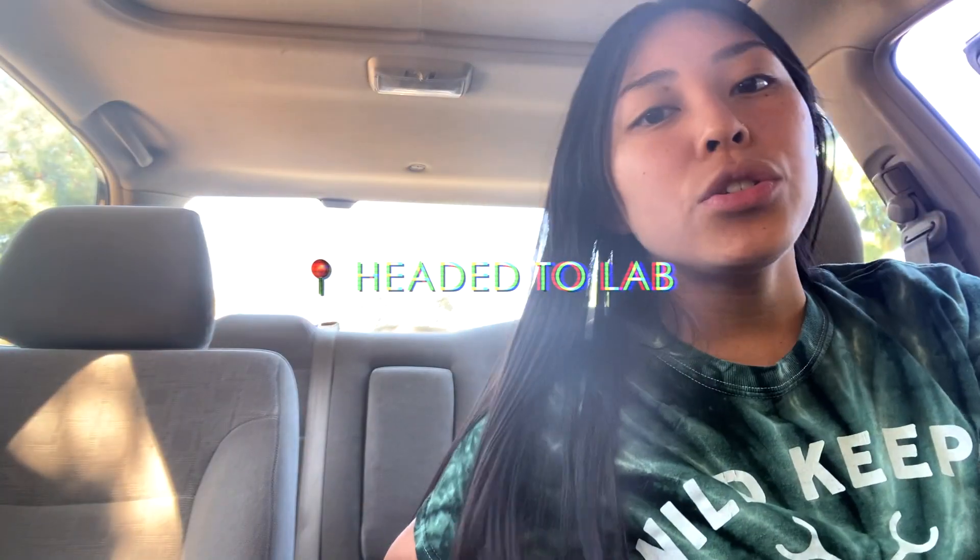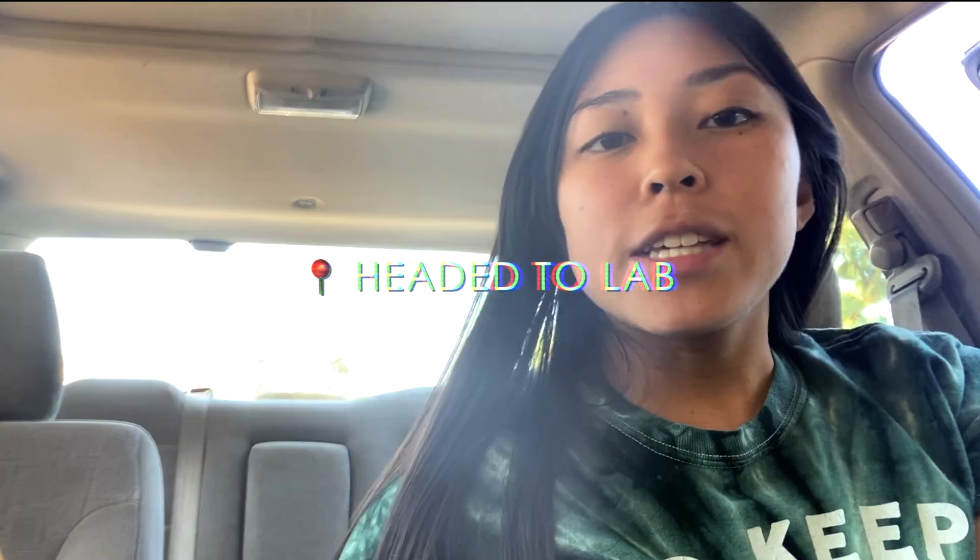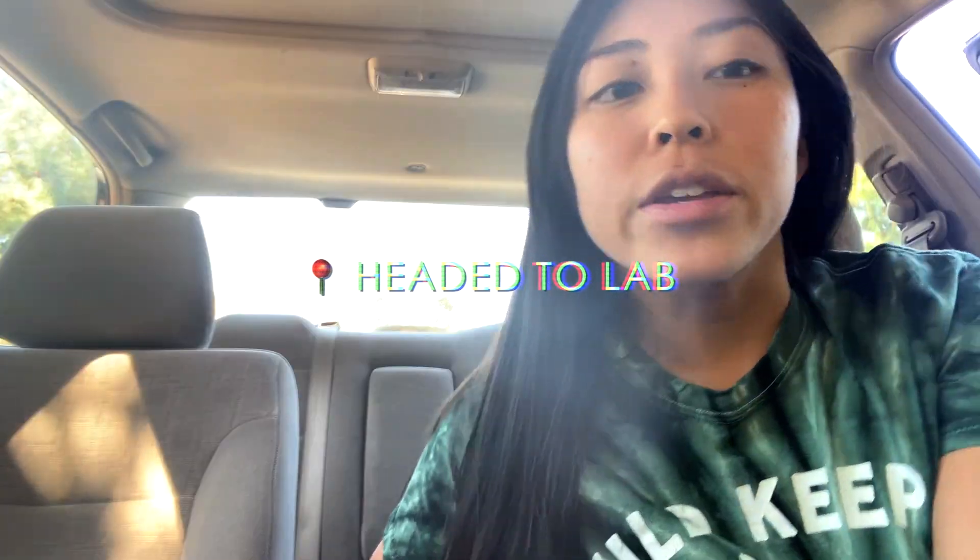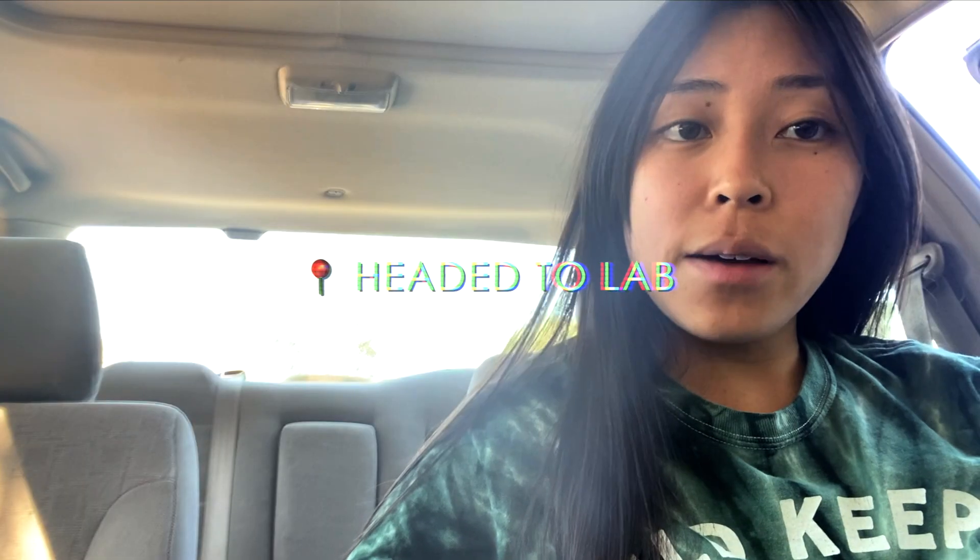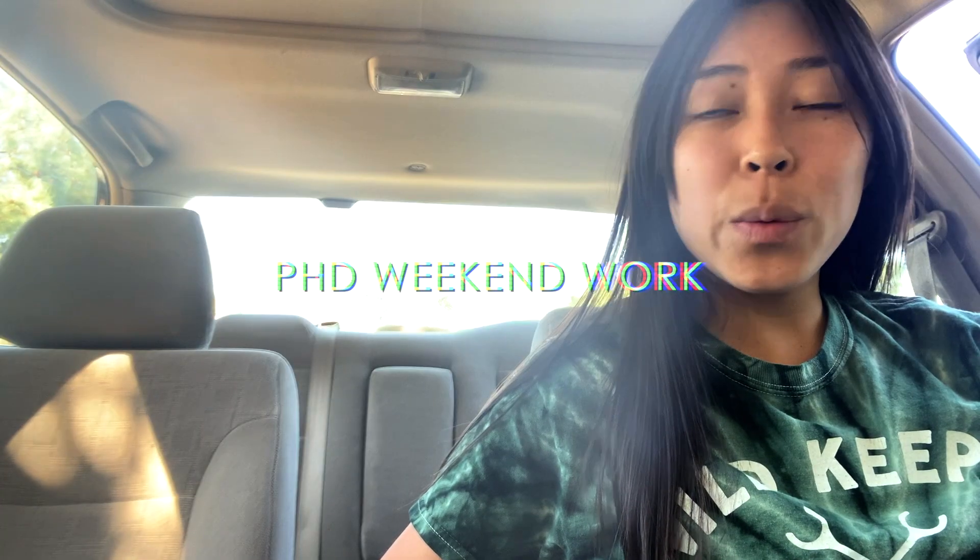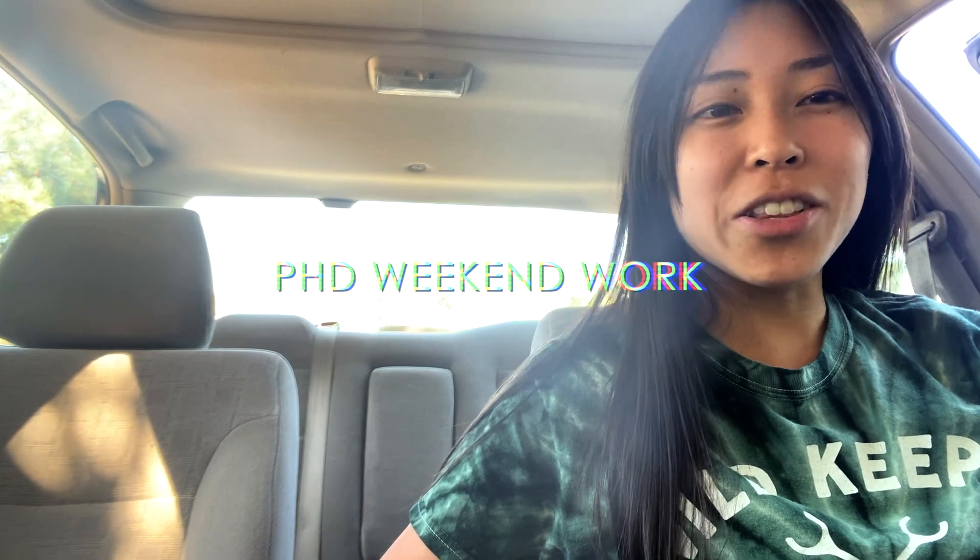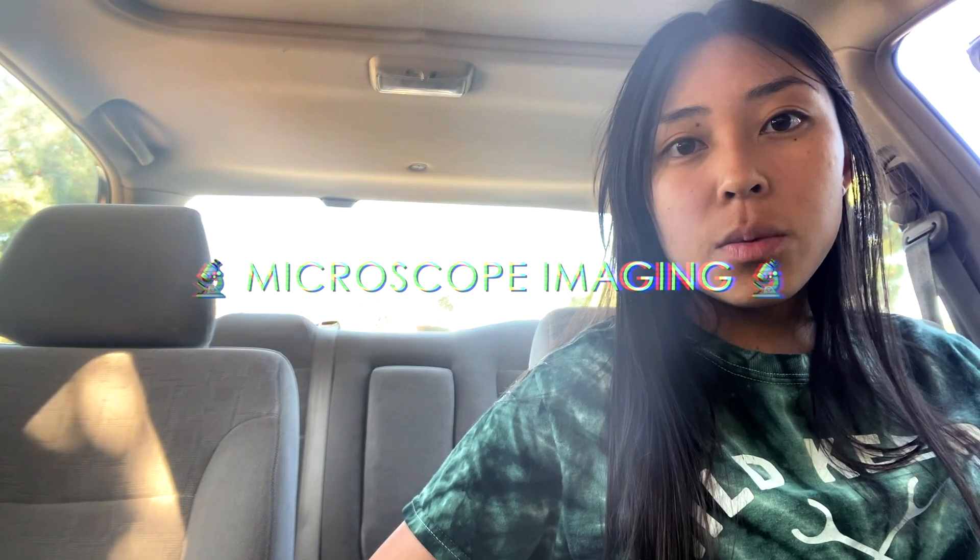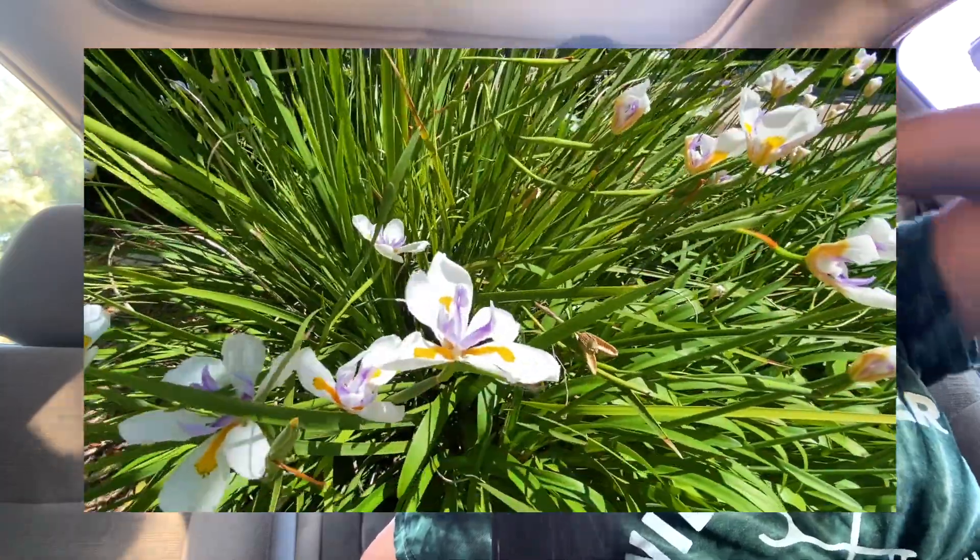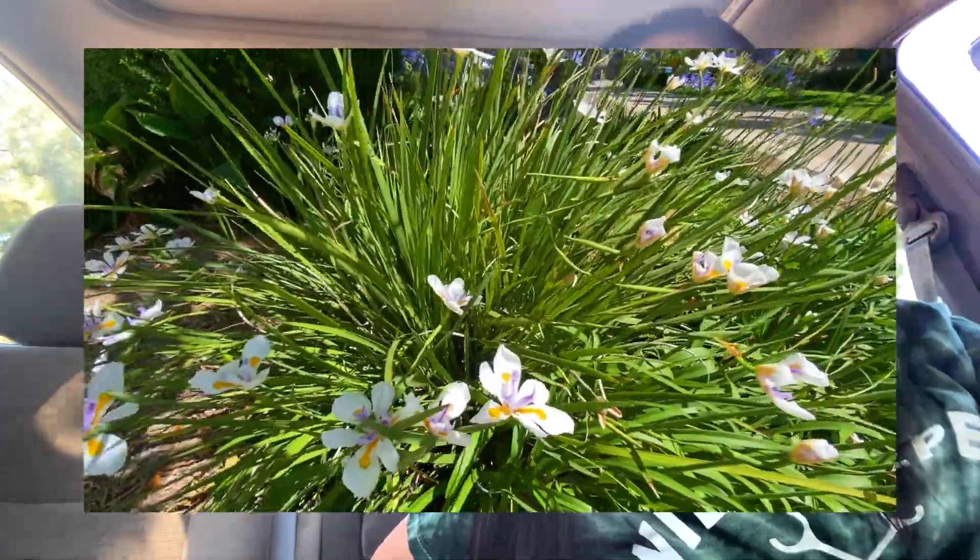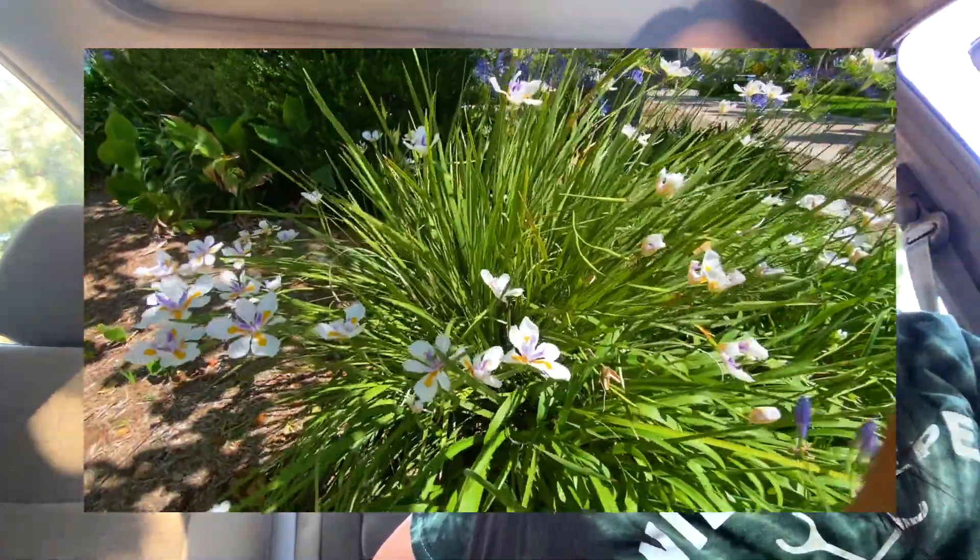I wanted to do a little day in the life video in the lab for a day, specifically what weekend work might look like. I am seven weeks from my newly scheduled defense date. Things are really crazy. I feel crazy. There's a lot to do. I wanted to do a lot this weekend to stay to my timeline, stay to my deadlines. So that means doing imaging on the weekend. I thought I'd take you guys along even though it's a beautiful day outside. It's finally sunny again. Gotta grind for a few more weeks, finish up my paper.